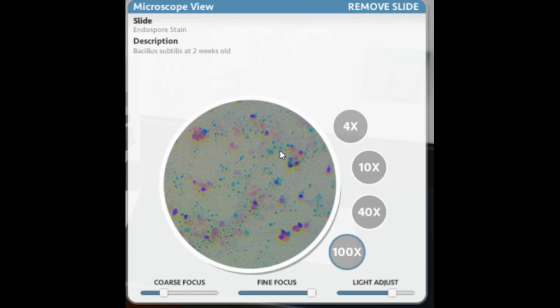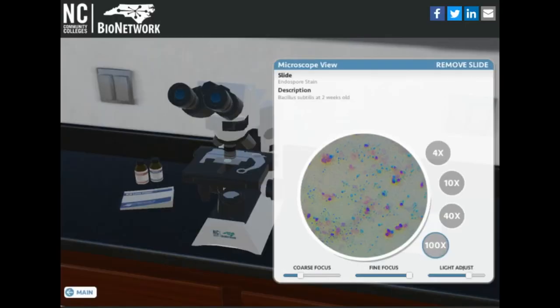So this really is a pretty decent example of what a crappy stain looks like. And you're like, what am I even looking at here? But this is the kind of experience I want you to have, to make sure that you understand that just because it's under a microscope, it's actually a skill.